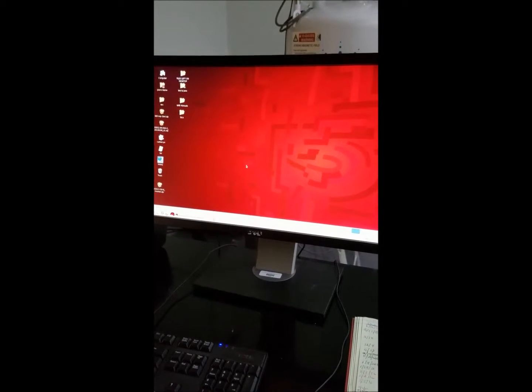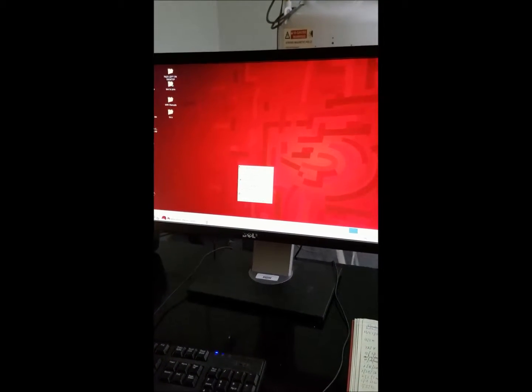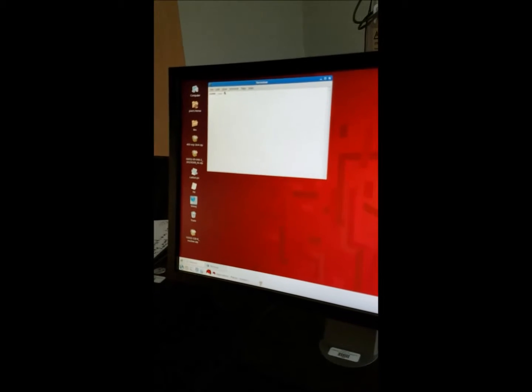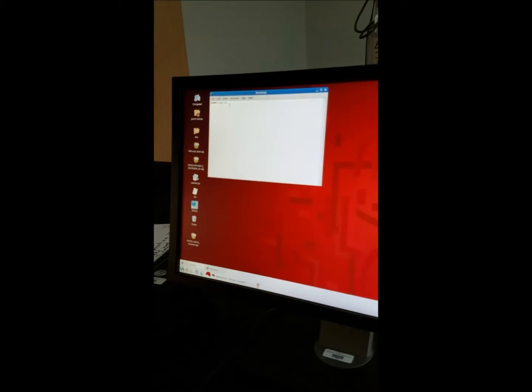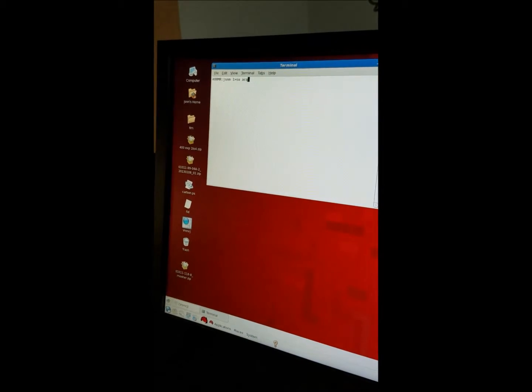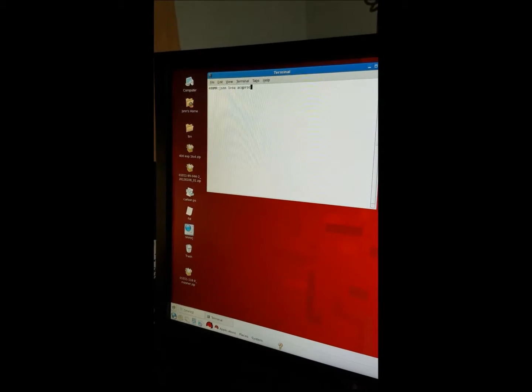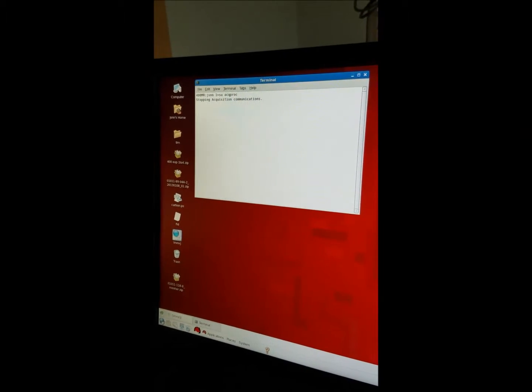After you turn the NMR back on, you have to come back to the computer and right click and go to open terminal. When you open the terminal, you have to let the NMR know to stop communicating with the computer. So you type in SU space ACQPROC. And when you do that, it stops communication. You have to wait for it to finish stopping.